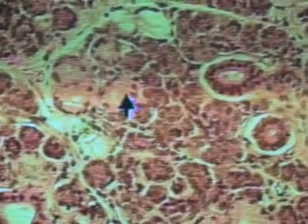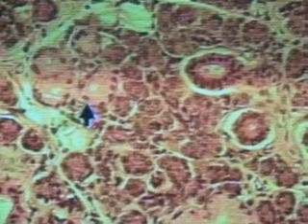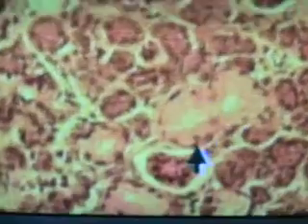But if you look at these now, the nuclei are near the base of the pyramidal cell, and the cytoplasm, the way it's fixed, is very filled with mucin material, not nearly the same granulated material that we see in the serous secretion. So here's a little cluster of mucus secreting cells, and here's another little cluster down here. So this gland is a mixed gland relative to the amount of material that's secreting.